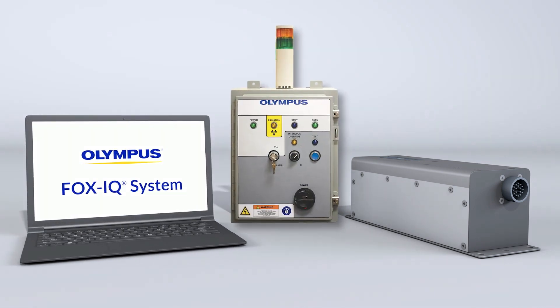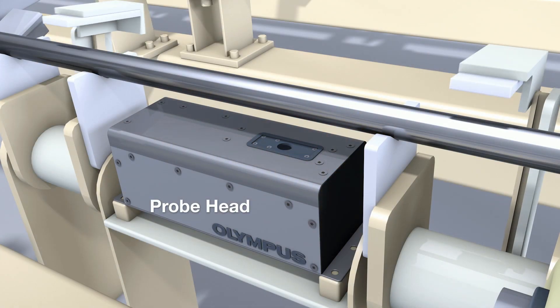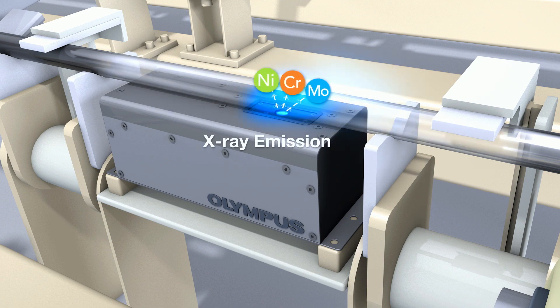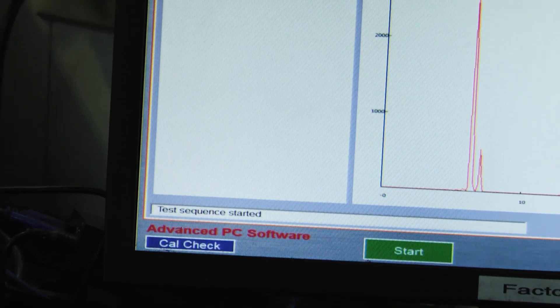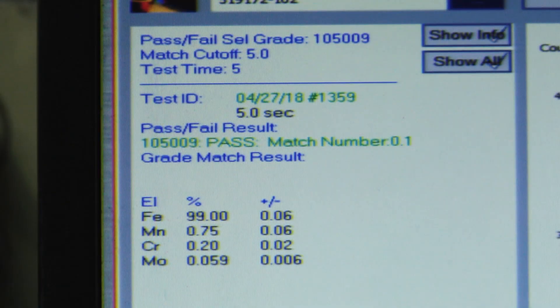The control box runs the system. A sample is placed over the probe head for analysis. The probe head emits X-rays to measure the sample material. X-rays cause the sample to fluoresce, and characteristic X-rays are sent back to the analyzer where they're counted by the detector. The detector measures the energy spectrum and determines which elements are present and in what concentrations.